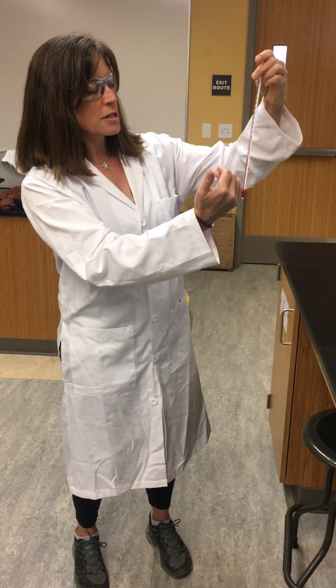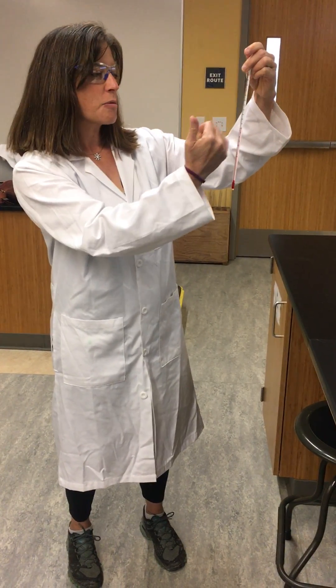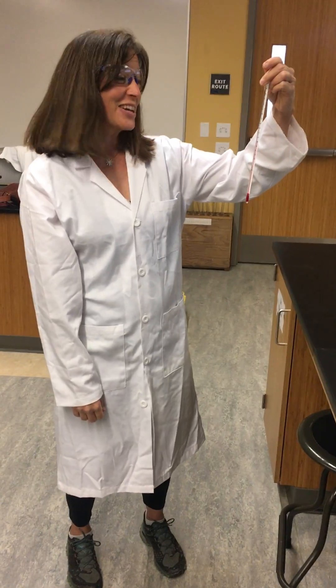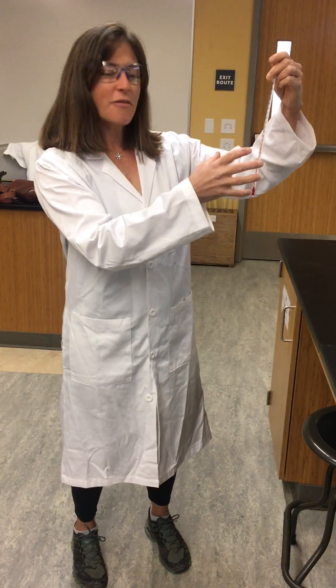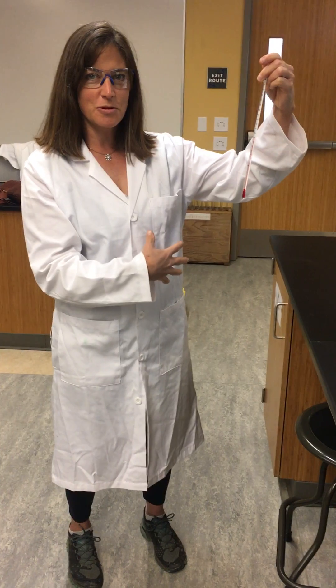So what we want to do is we're going to have our thermometer and we're going to just wait until it stops moving, and then we'll be able to measure the temperature. We will take a picture of this and then we will have you be able to measure the temperature of the actual room.